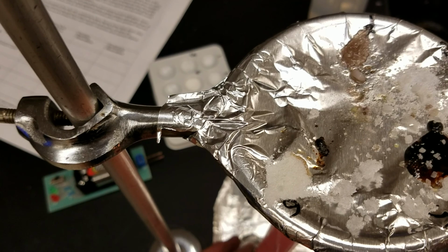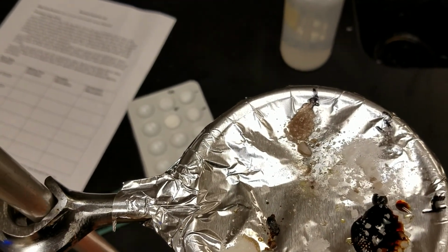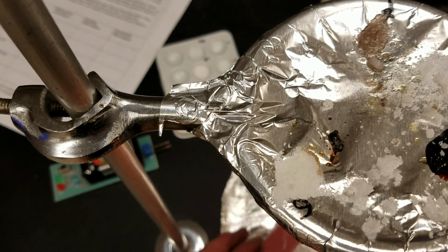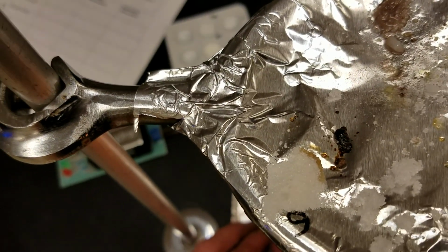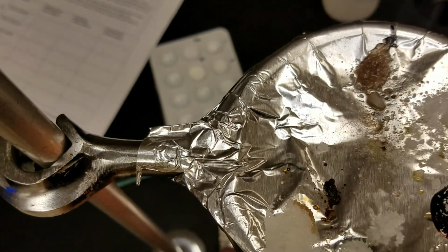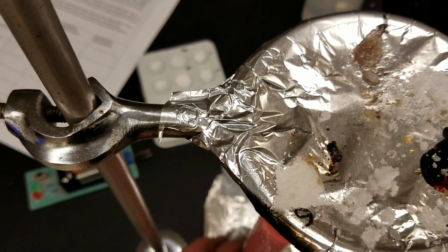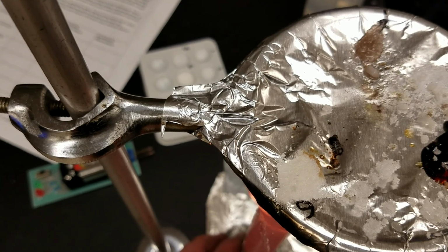We do have it melting. We do have it changing colors. It's not as quick as the sucrose was, though. And there is some smoke coming off of it.